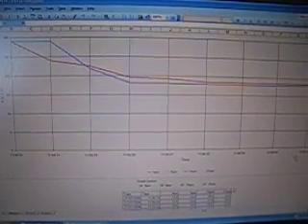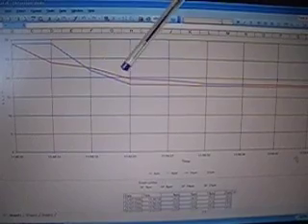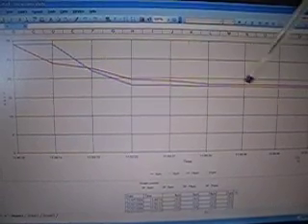What we're looking at now is the online software package from the particle counter. We've transferred the data across, and as you can see at this point, we can see a significant reduction in terms of overall impurity level of the fuel.